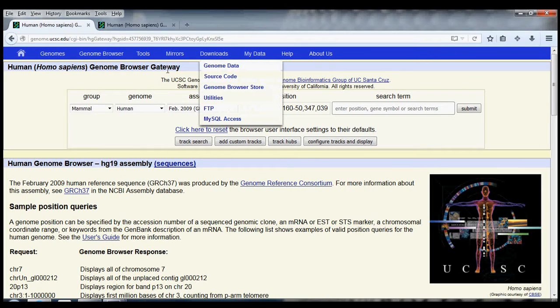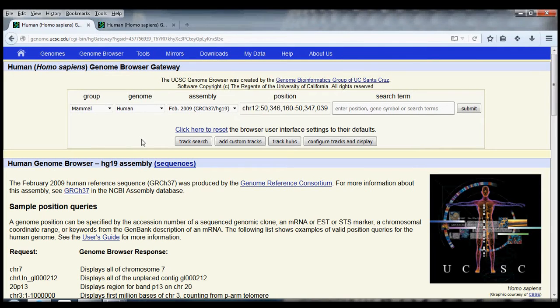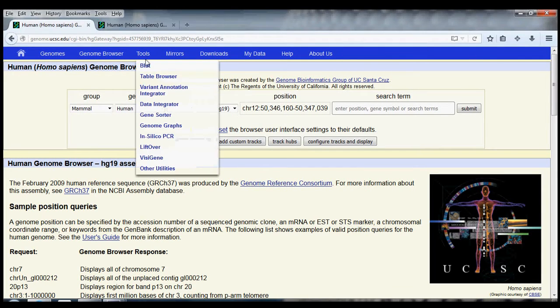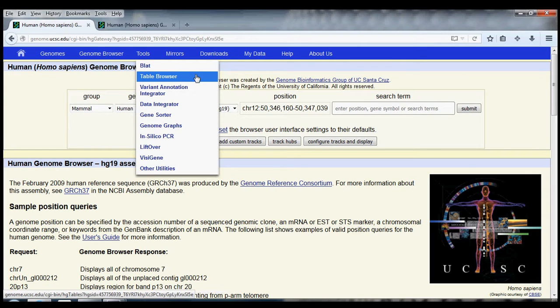In the last UCSC Genome Browser tutorial, we discussed the tool BLAT, which allowed us to take a sequence of nucleotide letters and find where that sequence is present in the human genome. In this video, we're going to discuss another UCSC Genome Browser tool, the Table Browser. In some ways, the Table Browser does the opposite of BLAT — we can take pieces of the genome and ask the Table Browser to give us the sequence of those regions.